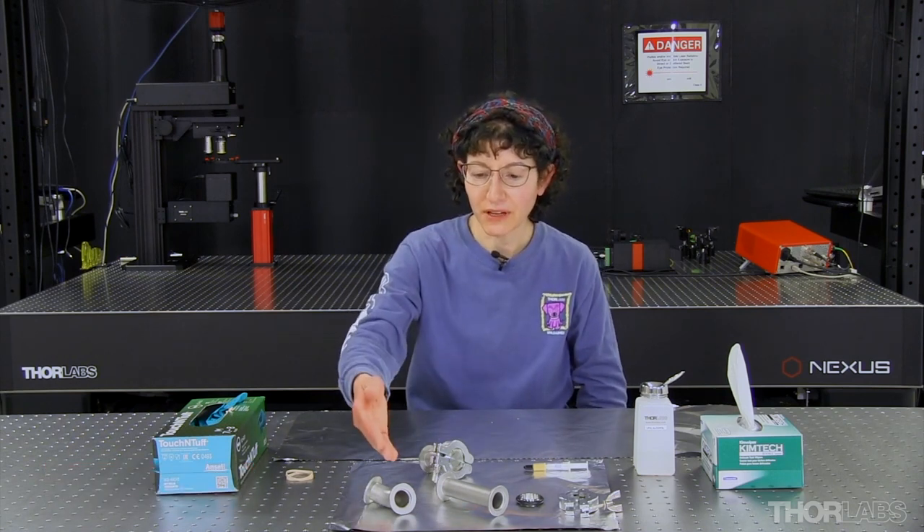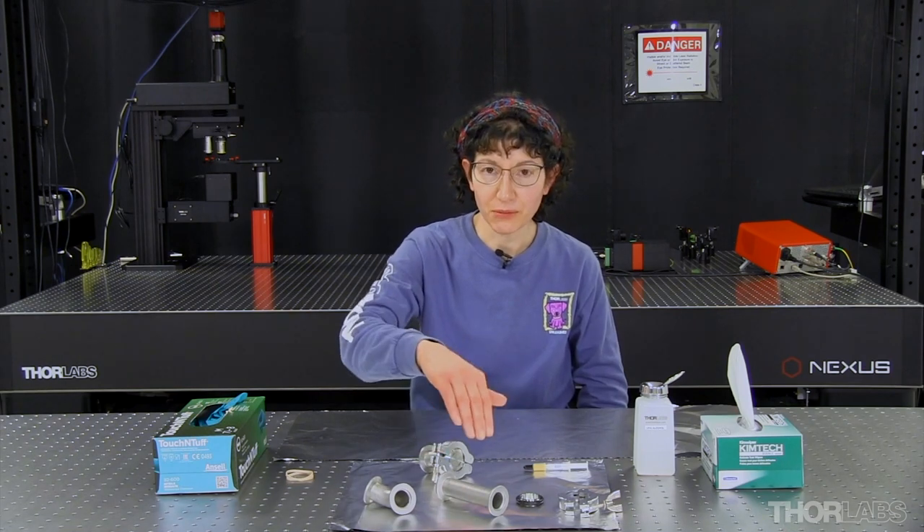Hello and welcome to Thorlabs. My name is Renee and today I'm going to be working with KF flanges. KF is an acronym for a phrase in German that means small flange. These flanges are also called QR flanges for quick release. Today I'll be working with several different types of flange components including an elbow, pipes, and a blank.